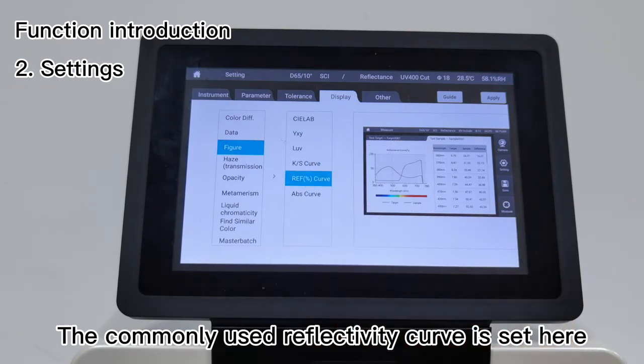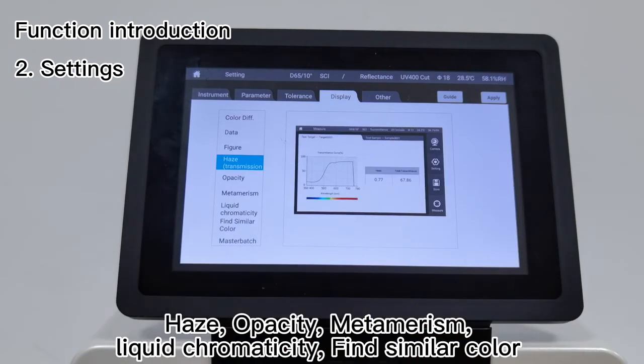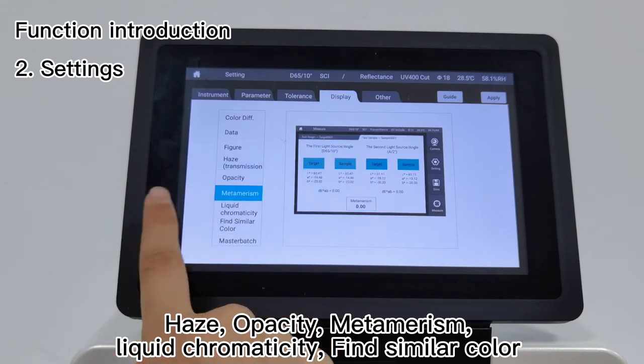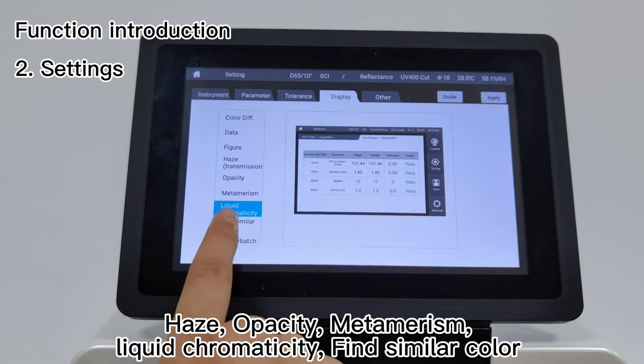The commonly used reflectivity curve is set here. Other features include haze, opacity, metamerism, liquid chromaticity, find similar color, and master batch.